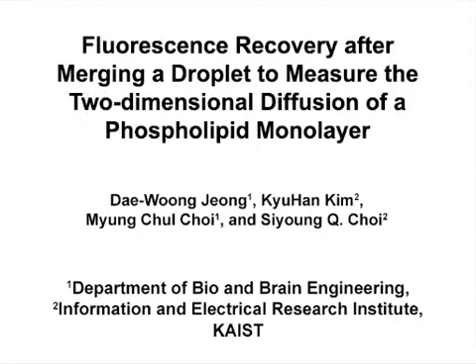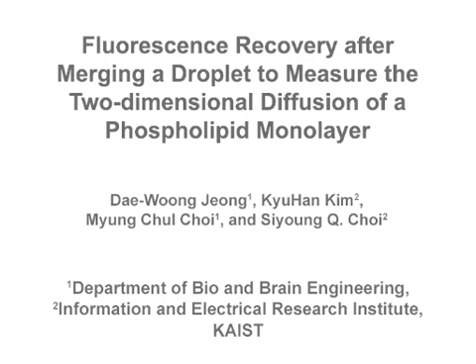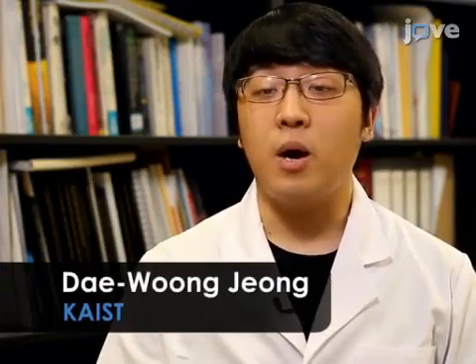The overall goal of this technique is to observe two-dimensional mixing of two different surfactants and extract the diffusion coefficient from that. This technique can help answer key questions in the biophysics and surface science field, such as the fluidity and interactions of different species in cell membranes, as well as interaction between surface active agents.